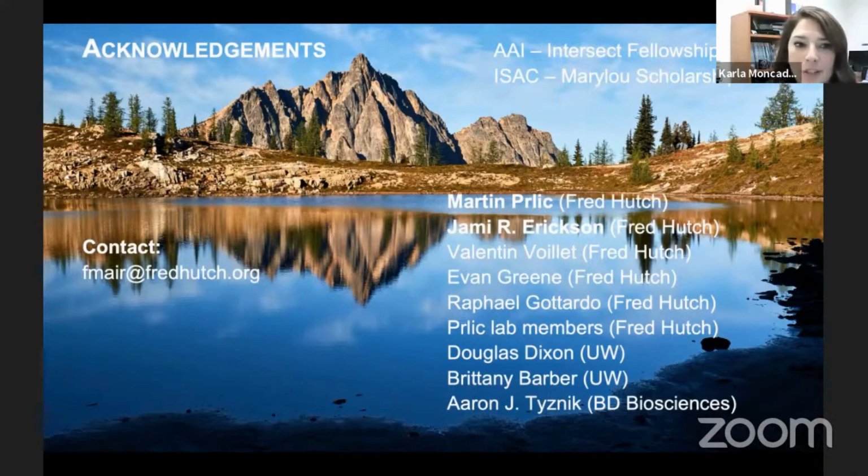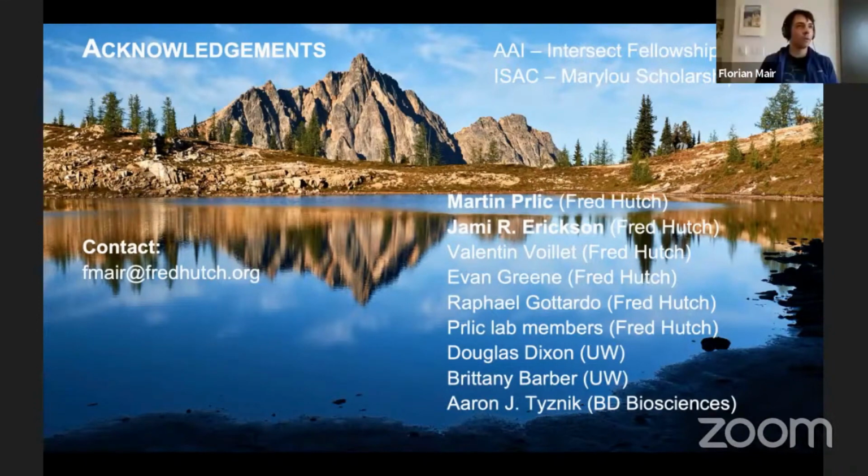And then we have a final question that came in through YouTube. They're asking if you've done immunostaining on tumor tissue versus mucosa with correlation to flow data. Actually, I have not done that myself, but I had a coworker in the lab who was initially focused on characterizing the oral mucosa. And she did that. For the most part, we can see good correlation between flow data and immunohistochemistry, which suggests that the cells that we are isolating are capturing whatever's in the mucosa.